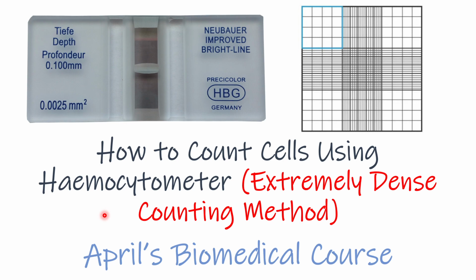Last time, we've learned how to count cells using the haemocytometer on the usual samples. By usual samples, what I mean is that the concentration of the cells within our sample is not so dense, it's not so high. And now, for this video, today we're going to cover how to count cells using the haemocytometer with another counting method, which is when the concentration of the cells within our sample is extremely high, extremely dense. So if you haven't watched the video before, then I suggest that you watch it first. You can see the link down below in my description.